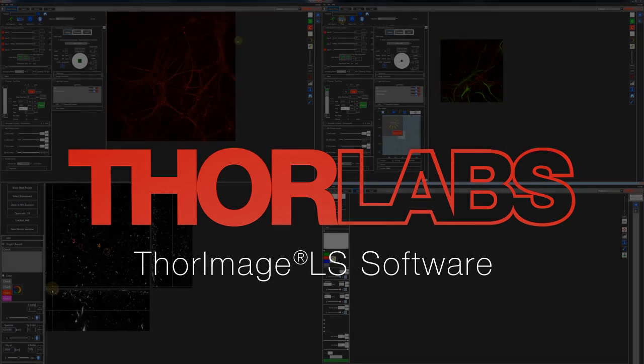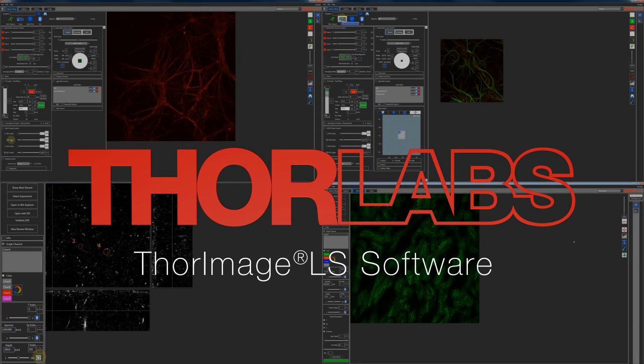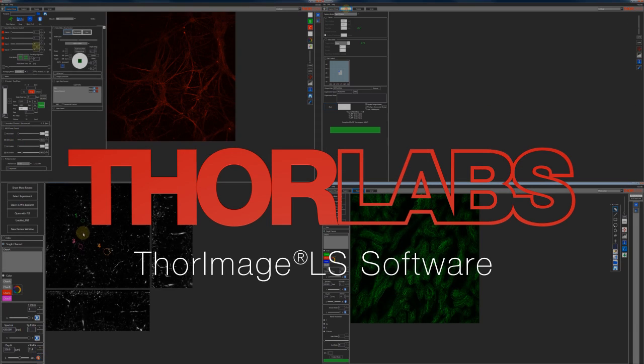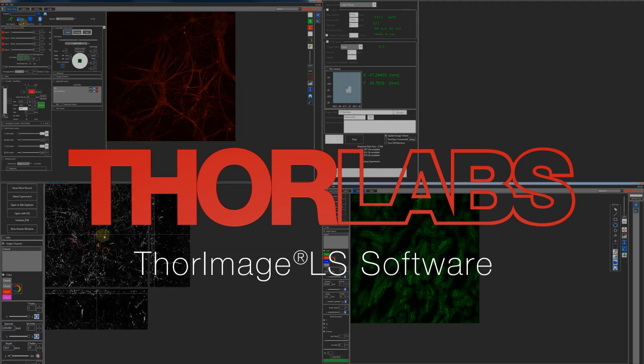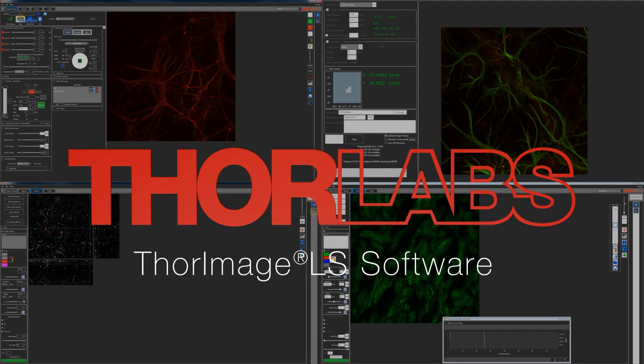ThorImage LS provides a complete software solution for our microscopy platforms. In this video, we will demonstrate multi-channel confocal imaging, high-resolution image tiling, 3D image stack functionality, and multiphoton fast Z capture.